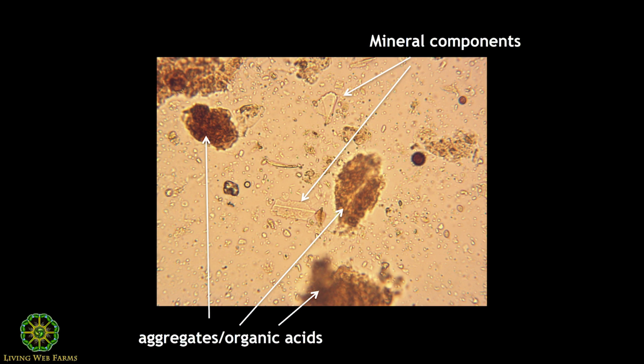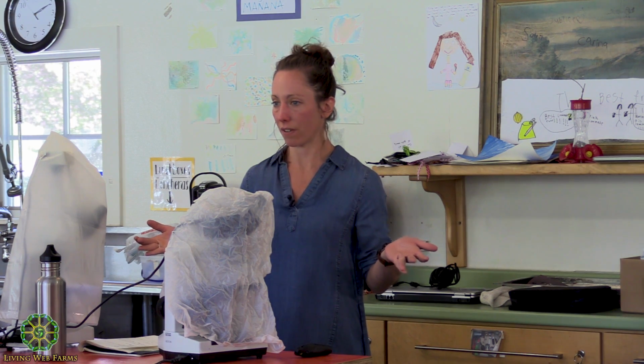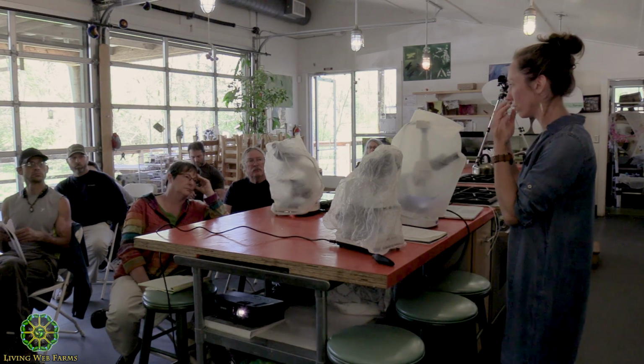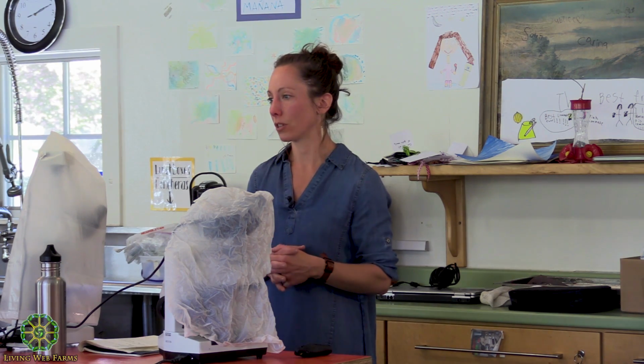So if we're not seeing aggregation like that, we probably need to get a little more air and a little more structure, and work on the structure of the soil. I think that's one of the things our compost was suffering from when I first started looking at it: we were overworking it. We were turning it far too much. So we were not only obliterating any fungal hyphae that were there, but we were also destroying structure and creating more of it that wasn't anaerobic, but was leaning that way, and it was just way overgrown with bacteria. It looked really good. It was crumbly, it was dark, it had all those visual cues that you associate with good soil, but when push came to shove under the scope, there really wasn't much to it at all.